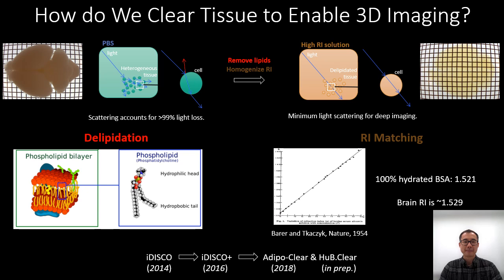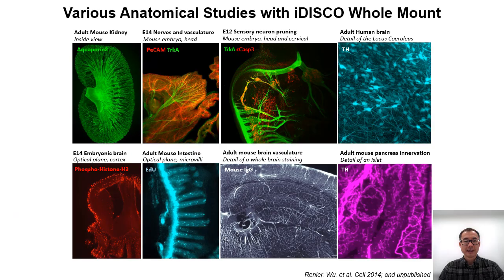With this said, we have been optimizing and developing our tissue clearing protocols through iterations over the years with my extended collaborators. Showing here are some examples done by our original protocol iDISCO that are still being widely used in the field for robust clearing and labeling of various tissues, covering brain and other organs, to profile the fine anatomical details inside.